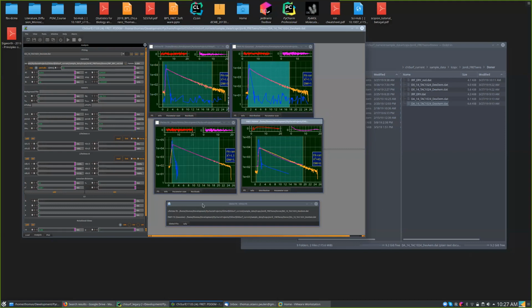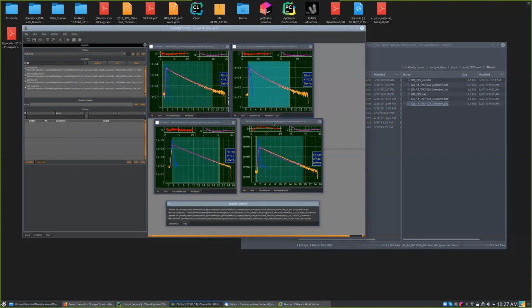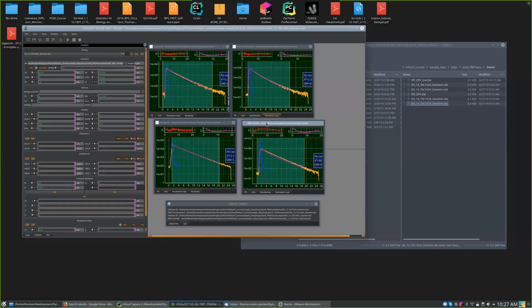Okay, what we can try now here is if you go to global fit, update and add again, you see now all 4 fits in the global fit. If you fit now, it should fit everything against data, and yeah, this takes a while now, a few seconds. So is there somewhere a button to see the process? No. Okay. Okay, you see now like all the fits are bad, but all are bad equally. All are equally bad. Let's put it that way. Okay. So meaning that we did something wrong here with the values we had.